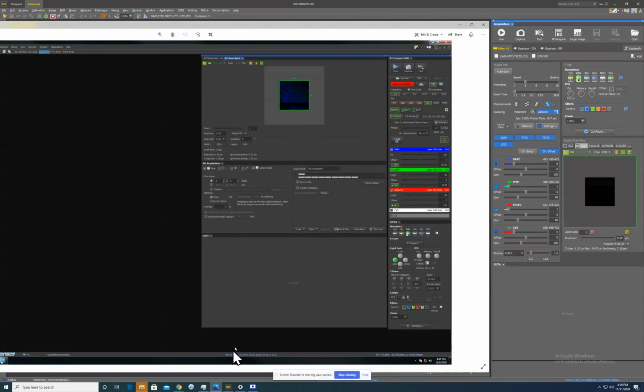So the next thing you're probably going to want to do is go from top to bottom, all of your normal little things here that you set up. So we have your pixel dwell here. We sometimes also call it exposure time. That's not technically correct, but it's something we often say. We generally recommend you start at 1.1. So the higher the pixel dwell, the longer it will take to take an image, but the brighter your resulting image will be. This is now over here called dwell time.